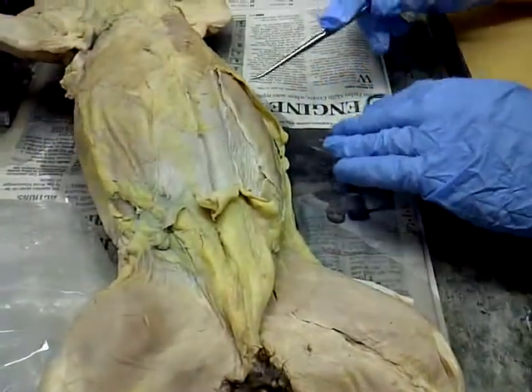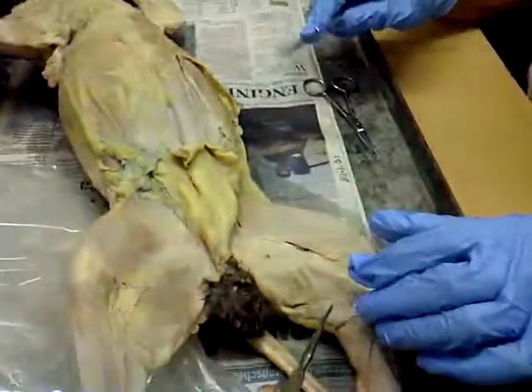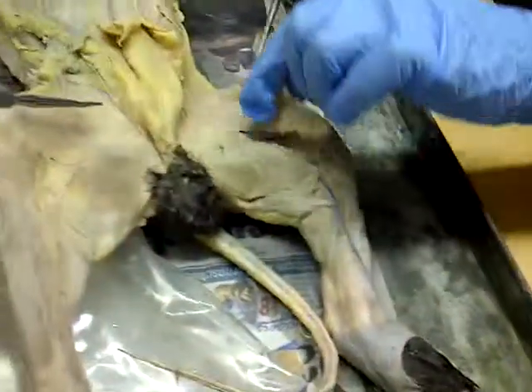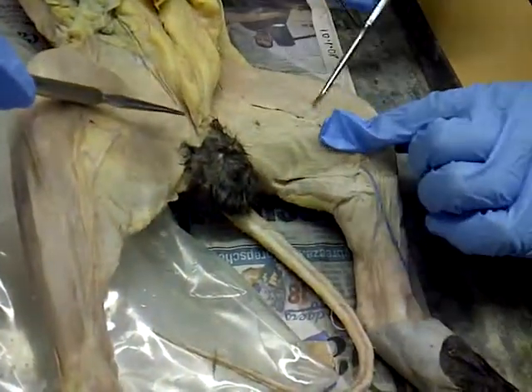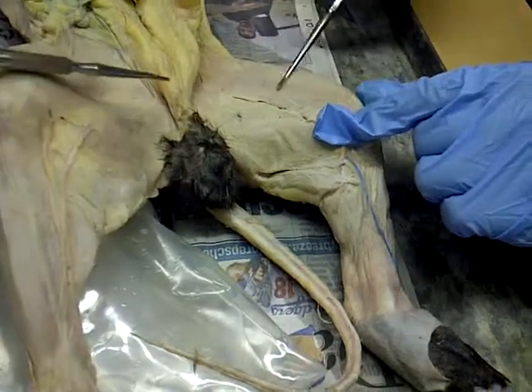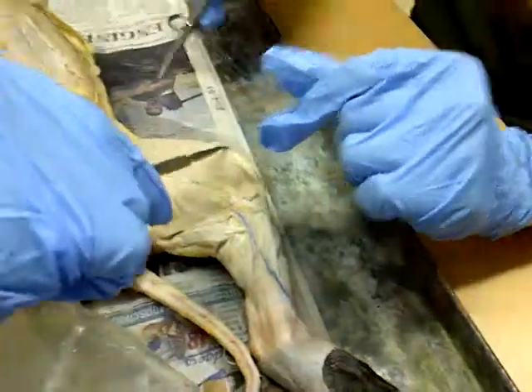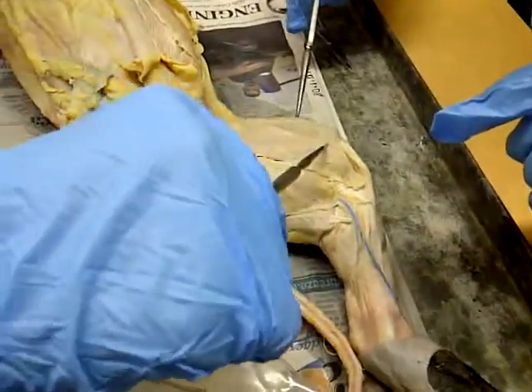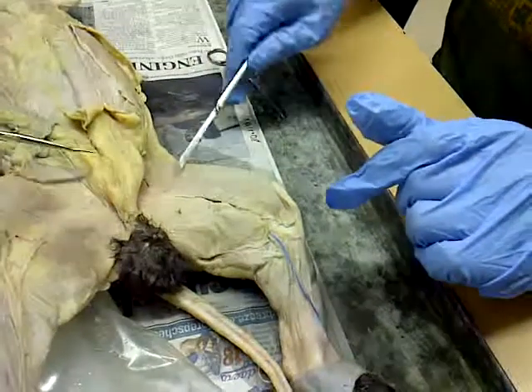So for the leg, we're going to go down to the inner thigh. There are two flaps here: flap number 1, flap number 2. This one, on the lateral side, is the sartorius. And medially is the gracilis.